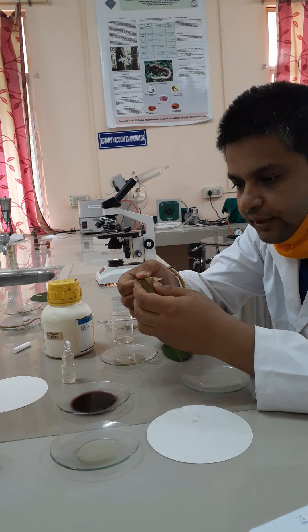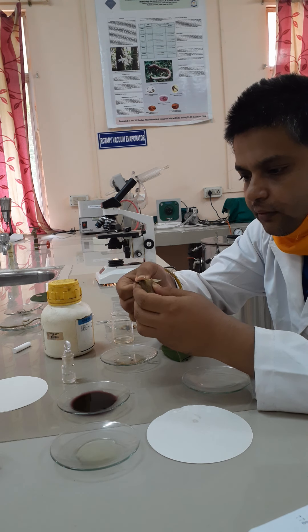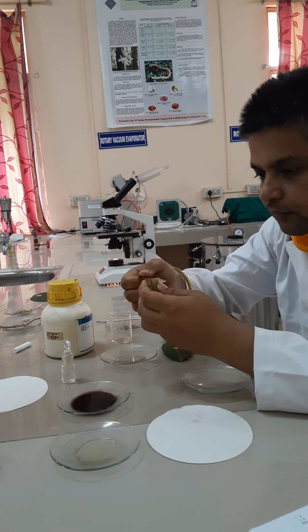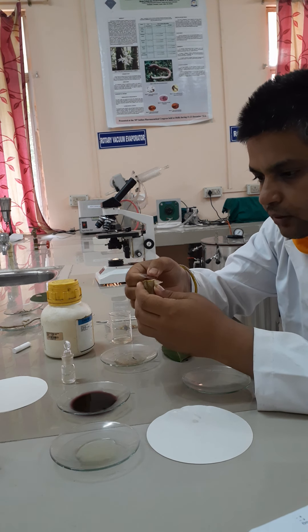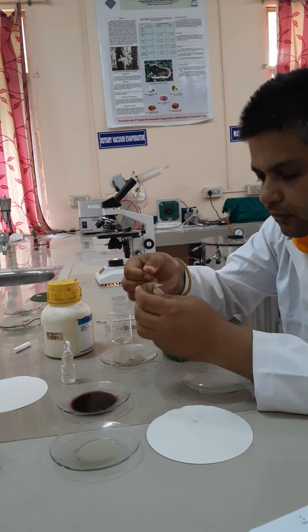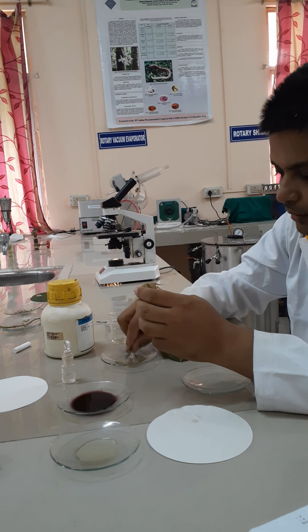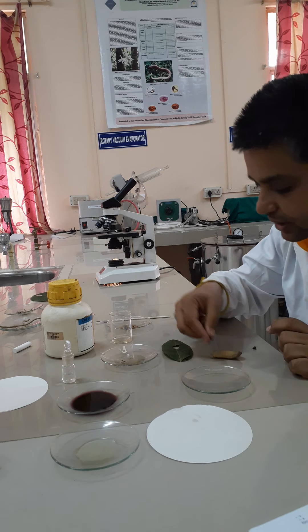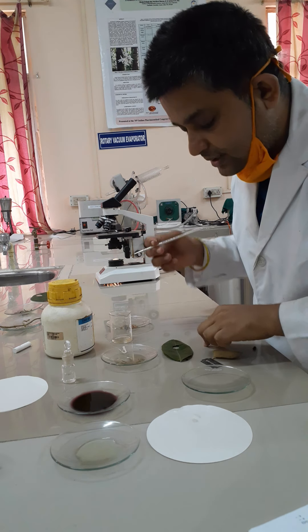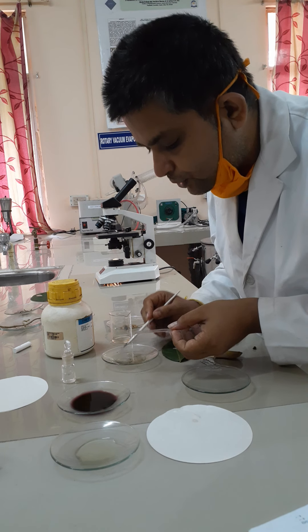With the edge of the blade, take very smooth sections. Take as many sections as possible, then select one or two very smooth sections from those.